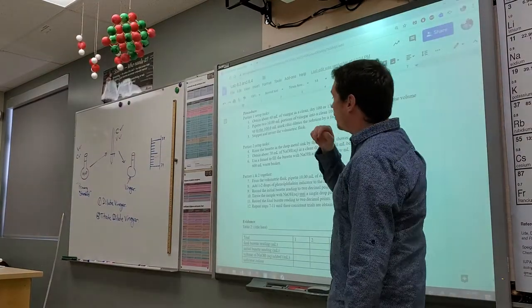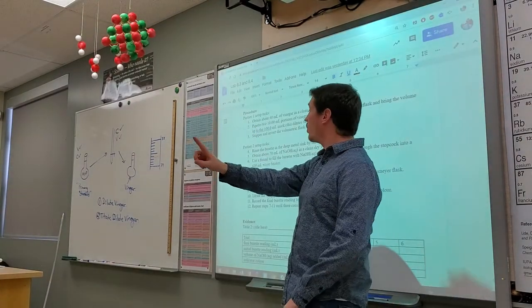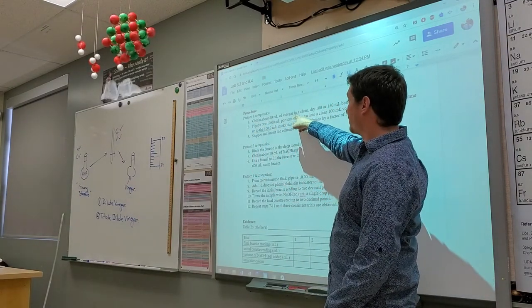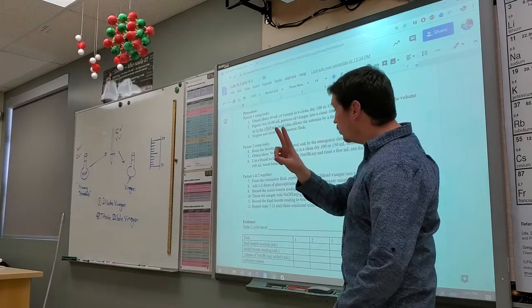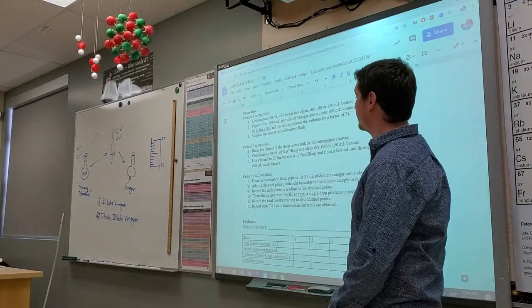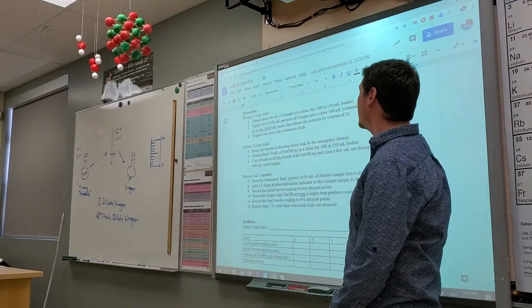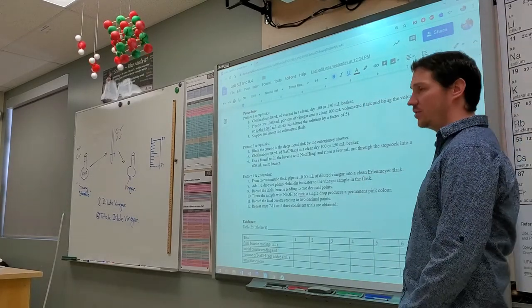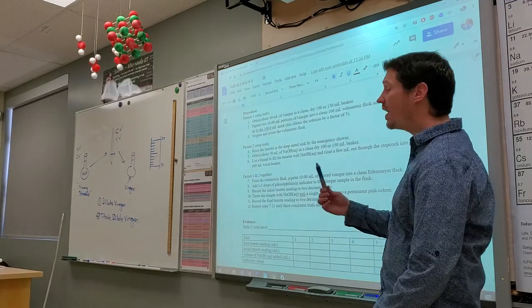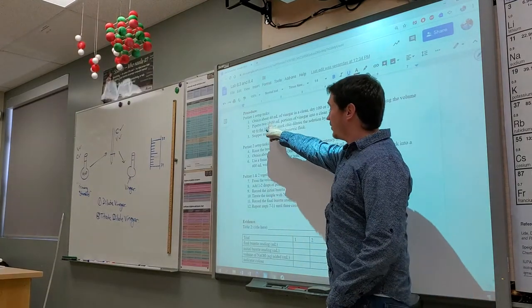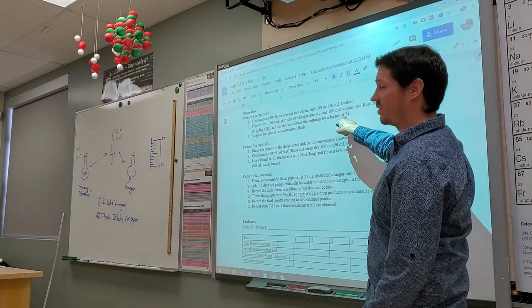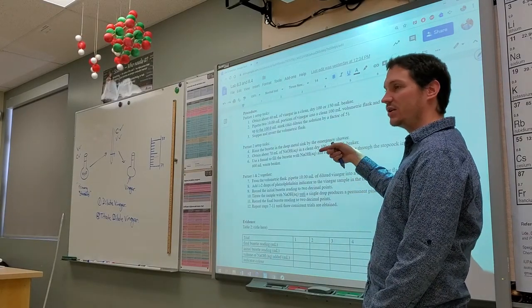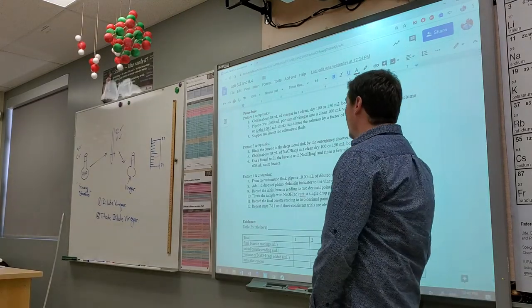Partner number one is going to obtain 40 milliliters of vinegar and pipette two 10 milliliter portions into a clean 100 milliliter volumetric flask and bring the total volume up to 100 milliliters. That's 20 milliliters inside 100, so that's a dilution factor of five.